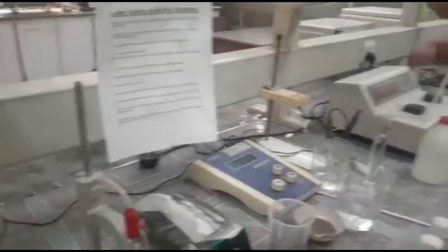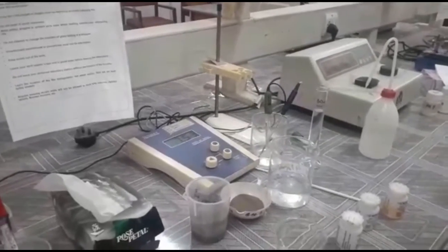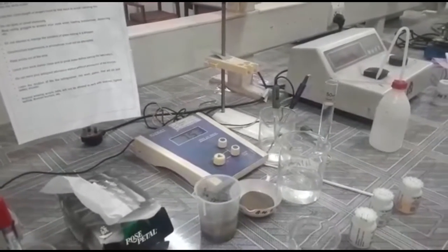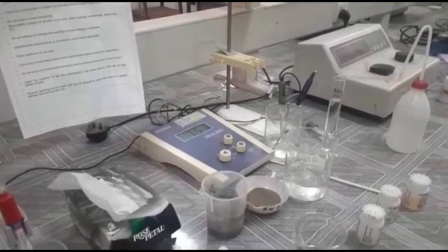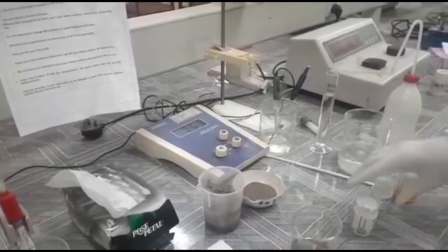First of all there should be a pH meter, and then a measuring cylinder, then we need a glass beaker, then also a washing bottle, and of course we need soil.